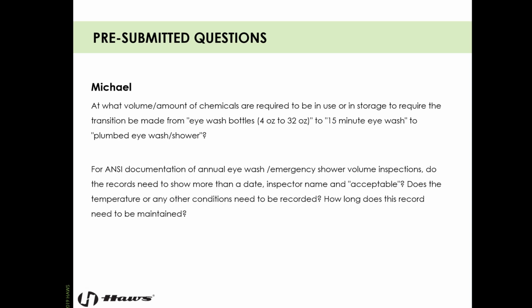Any amount. You are not to use eyewash bottles unless they are supplementing plumbed equipment. That's their only purpose, to supplement primary equipment. So eyewash bottles should not exist on their own anywhere.